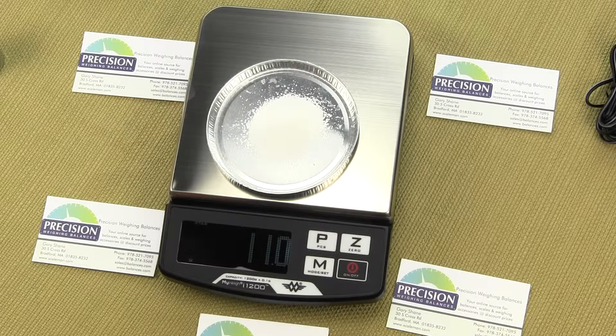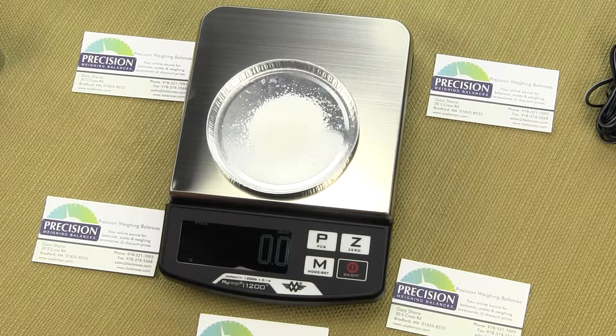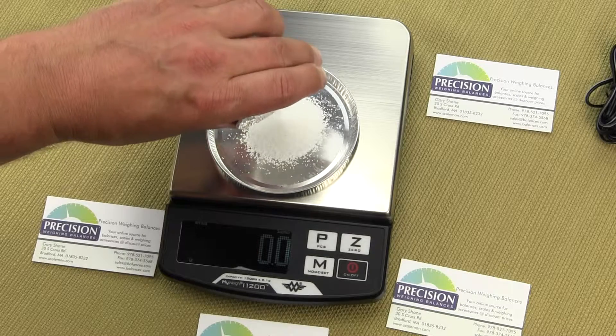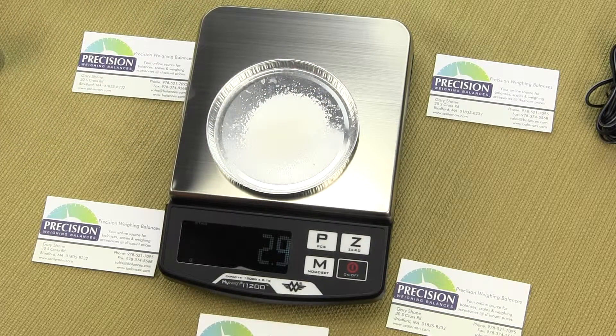It's showing 11 grams, and if we wanted to we could tear that out by pressing the Z key, and again we could add more. You can see how quickly the display responds. This is a really nice affordable scale, especially for the educational market.